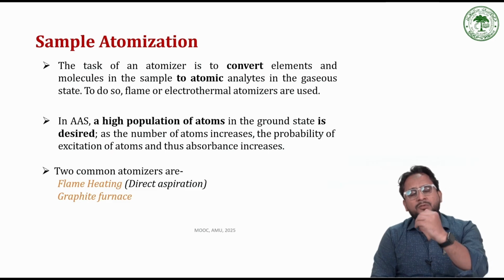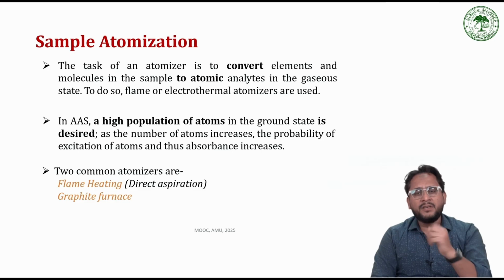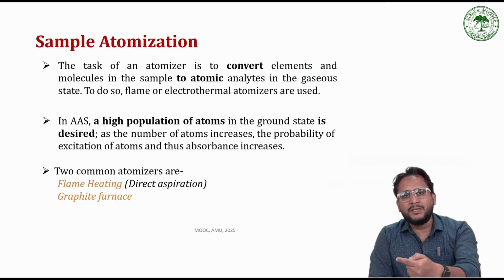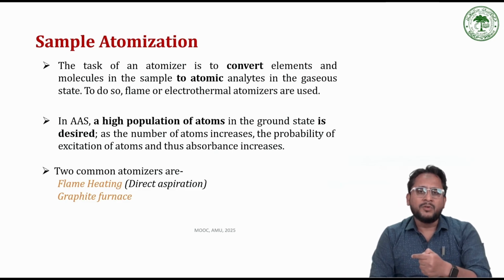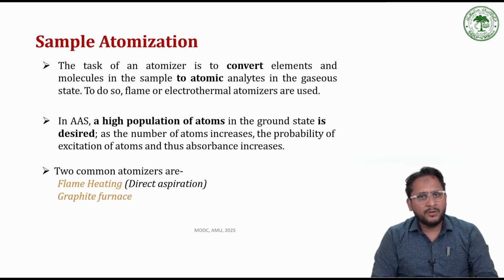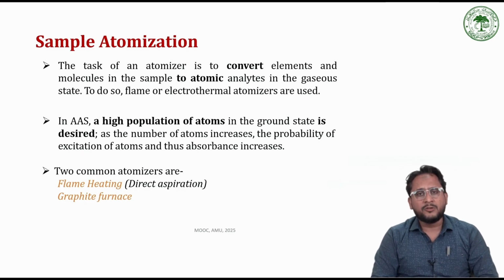If the aerosol is not properly formed, or the droplets are not evenly distributed, a large volume of sample is directly injected into the atomizer, which will cause the temperature of the atomizer to drop, or it may extinguish the atomizer. Therefore, the nebulizer is very important. The flow rate control as well as the formation of aerosol, both are very important.